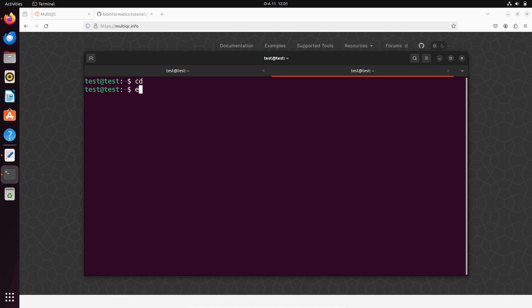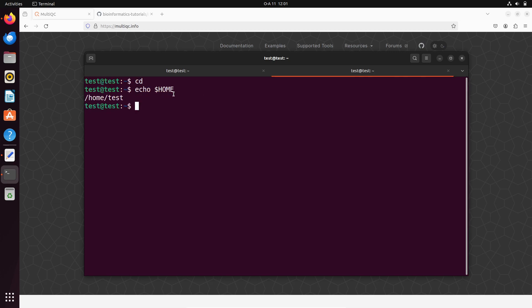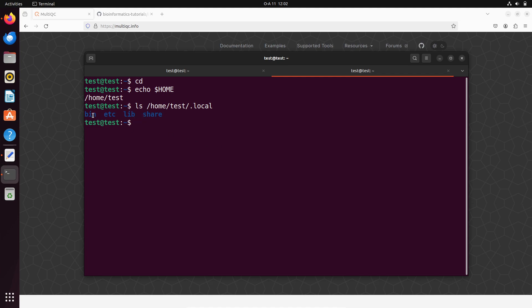First, make sure you are in your home directory. Type 'echo $HOME' to see your home directory displayed — it should match what you saw during installation. Mine is '/home/test'; yours will likely be different. Now do 'ls /home/test/.local' and you'll see some directories: bin, lib, share, and others. For this tutorial we are going to focus on just 'bin' and 'lib'.